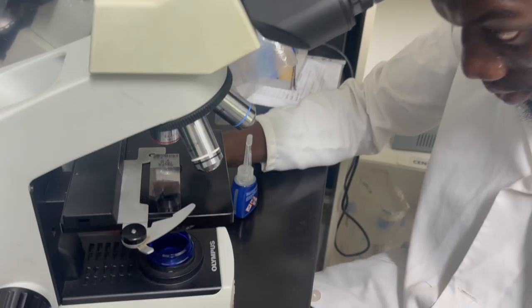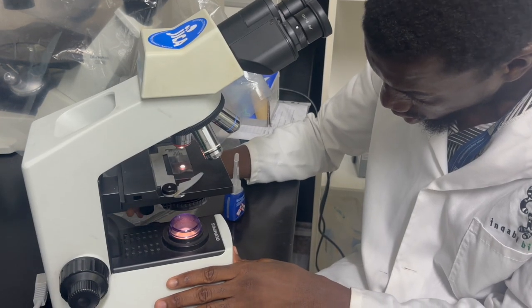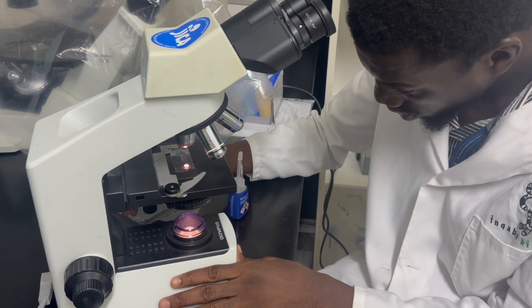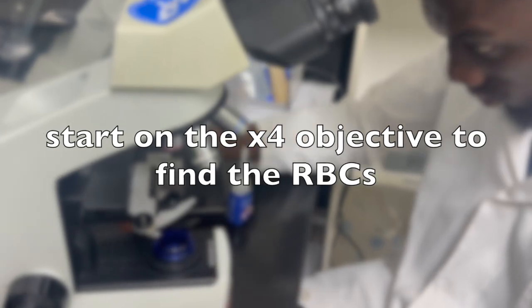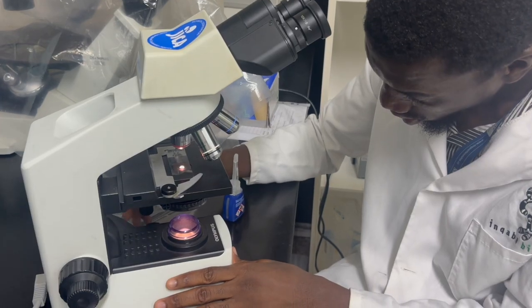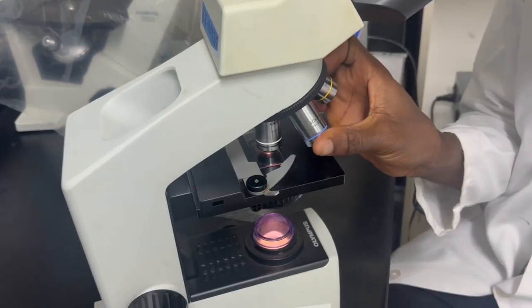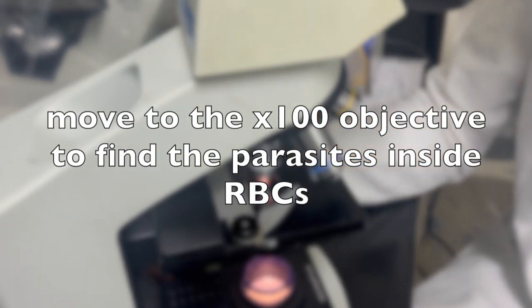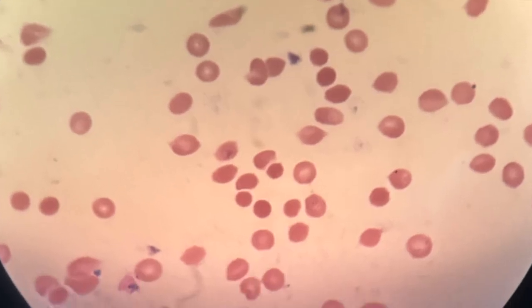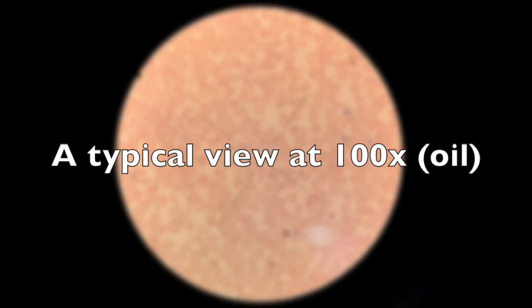Start on the 4x objective to locate where the red blood cells are on the slide. Once that's in place, move to the 100x oil immersion objective, rotating the wheel to get to 100x. Use only the fine focus to visualize the red blood cells and identify the parasites inside them.